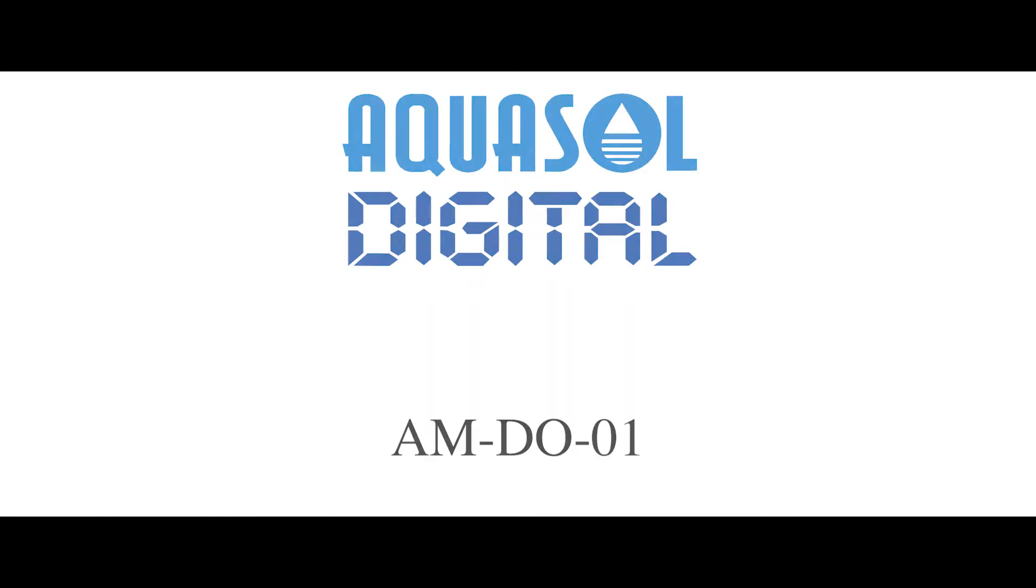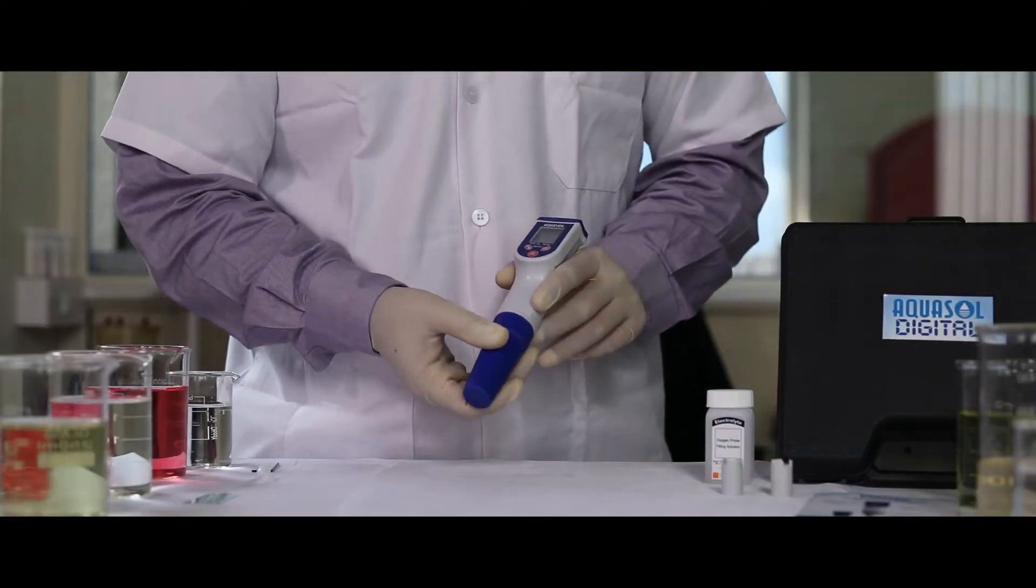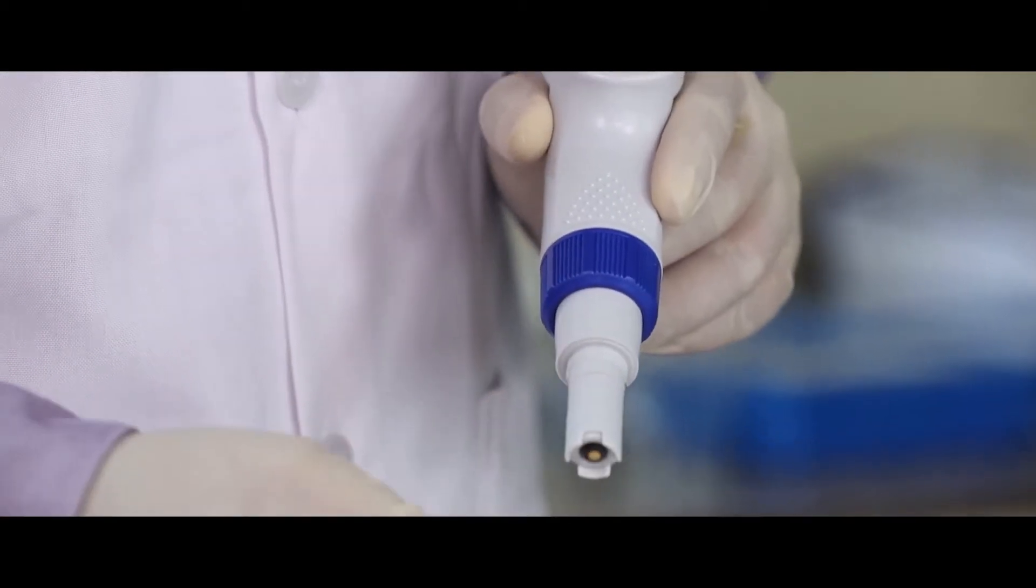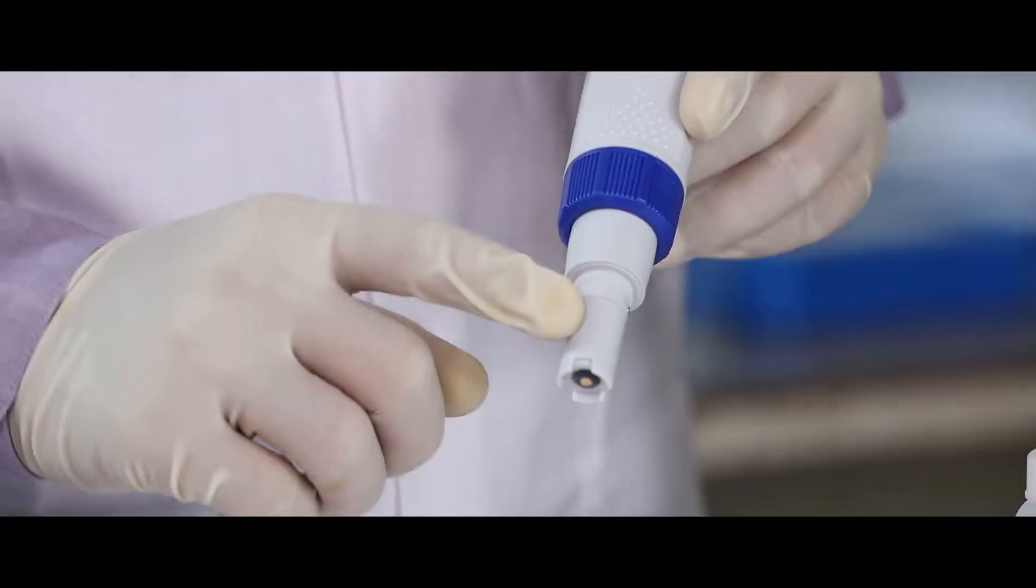This is the AMDO01, a handheld meter designed to measure dissolved oxygen. Remove the protective cap to begin. This is the electrode soaking bottle and the electrode of this meter.